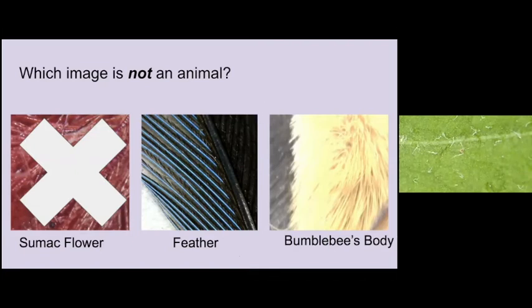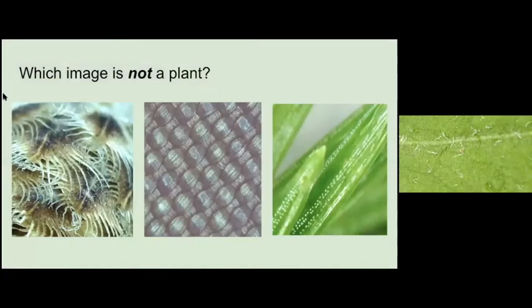Do we have time for one more, Elizabeth? Sure, yeah. Okay, so another one, kind of tricky too, but you guys are really good at this. Let's hear some observations about these three images. The third one is a plant. The second one, I don't know if it is, but I think the second one isn't. Since I think the first one looks like an underwater plant. Since it could be an underwater plant.